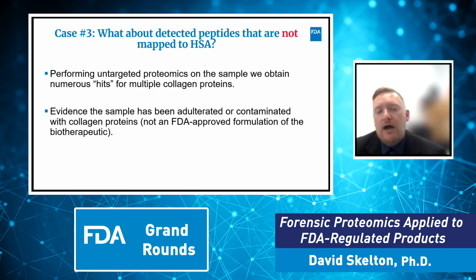And I will just note here, many of these samples that we get are ongoing criminal cases with the Office of Criminal Investigations. So I am being somewhat ambiguous with what the biotherapeutics are. However, I can state that there is no FDA-approved formulation for this particular biotherapeutic that allows collagen proteins to be present. So this is indication that it's been adulterated or contaminated.